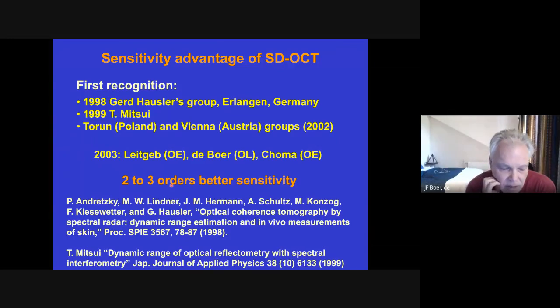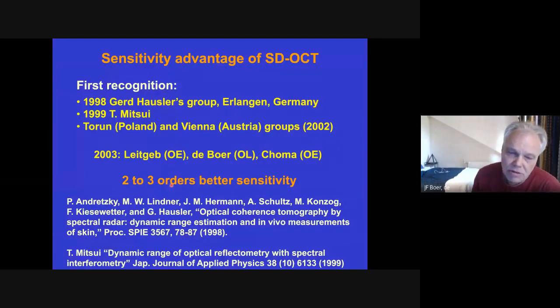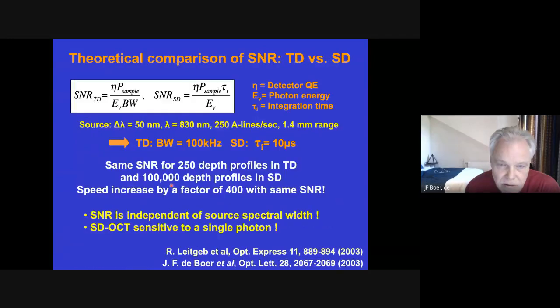Normally, if you take a picture with a photo camera and you decrease the exposure time of the film, the shorter you make the exposure time, the grainier the photo gets, so you lose quality. But here, you could go 300 to 1,000 times faster, while you could acquire the same quality images as before. So this was a major breakthrough in this technology.